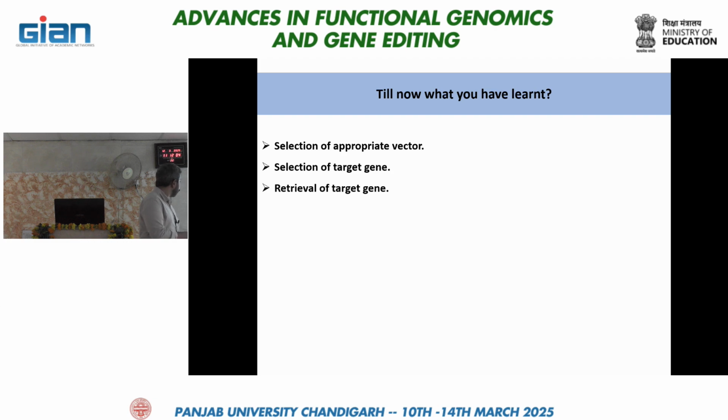And you have also covered retrieval of target gene from databases. Similarly, there are specific databases as well, like if you don't get any sequence in NCBI or these first-hand databases, then you can go for specific databases. I can give you an example of plants because I work in plants. There is Sol Genomics, where you can find genomes of Solanaceae family, and the SPUD database where you can easily find Solanum lycopersicum and Solanum tuberosum.